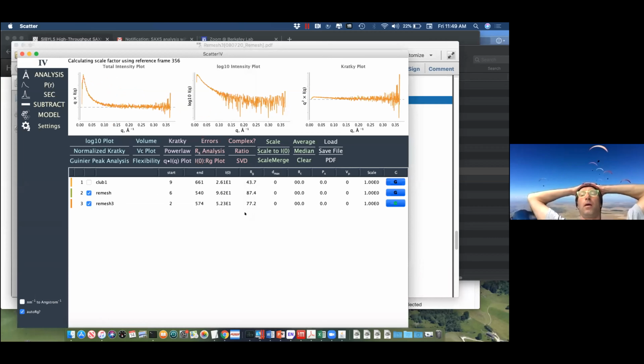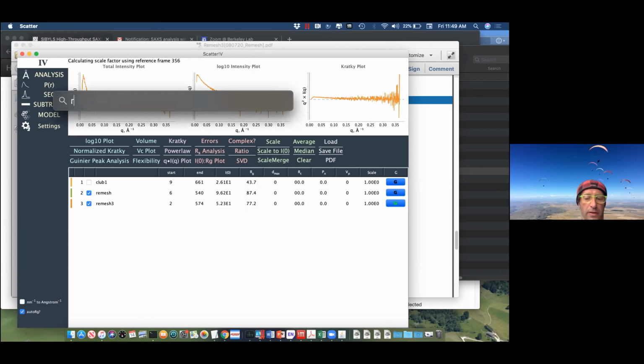Anyway, so those are examples of how we're using ScÅtter. Some people I communicated with yesterday had a problem with ScÅtter. There were multiple issues. It could be Java, it could be that they're using ScÅtter 4, which is not the latest release, or your computer just doesn't like ScÅtter. There are other programs that we can use the same way. I will not show them here, but I just want to mention a so-called program that I personally like a lot.